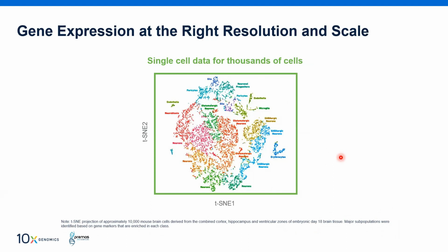So we are adding one more dimension to my NGS data, that is, from which cell the RNA is coming. Now, you have to do tissue dissociation to get the single cell suspension. People working on tissues demanded that no, we don't want to disrupt the tissue. We want to map the data on the tissue image only, or the tissue surface, or the tissue section only.